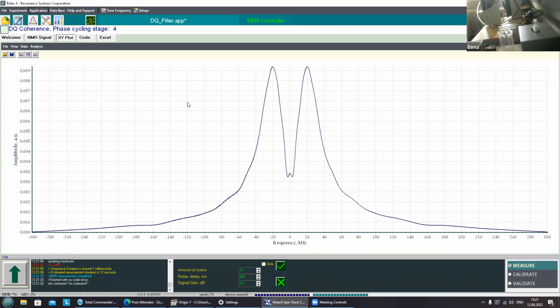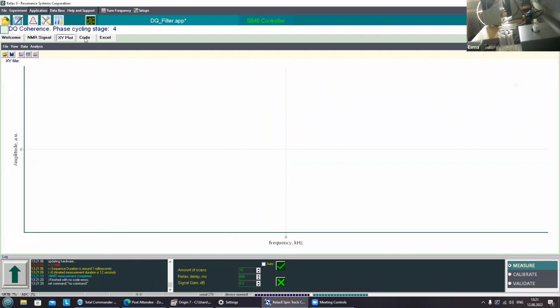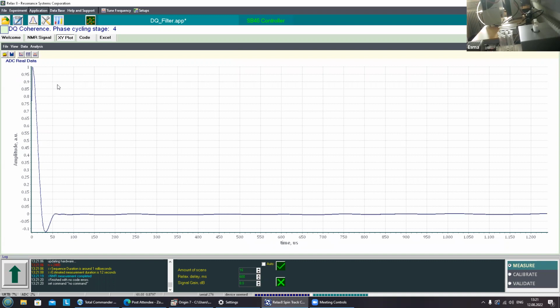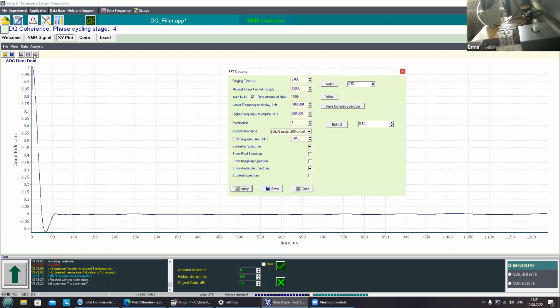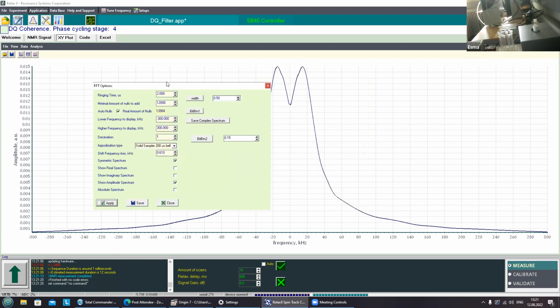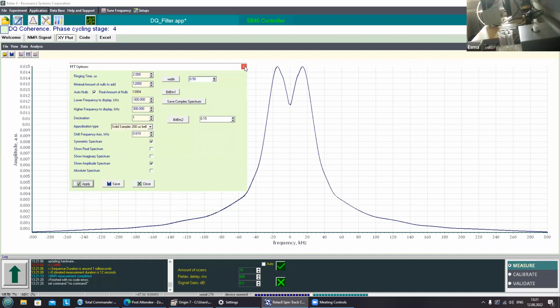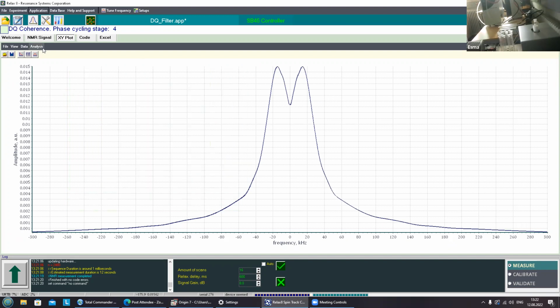Okay, I will go to Untitled again. Let me clear this part to see it in a good way. If we get our curve, we can see that the crystalline part is maybe smaller, and we will see in the spectrum that it will be that way. We can see that the gap is getting smaller and it's going up, and the distance is also changing. And we can maybe try a higher one, really higher one. We also tried many combinations, and I will show them in a separate file in Origin to make it clear. Dr. GRUNIN already showed you, but it can be additional information for you.